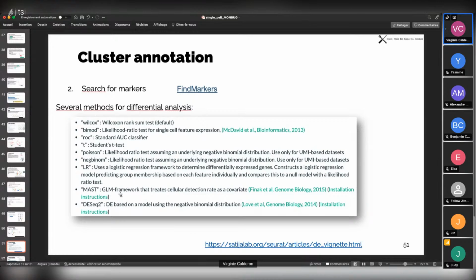So a lot of options. Maybe it can be interesting to look at two options, MAST and Wilcoxon, and see how many markers are in common between the different options. It's the same as in our RNA-seq analysis. We recommend using at least two approaches, maybe DESeq2 and edgeR, and see what is common, to continue the work only on the common differentially expressed genes.